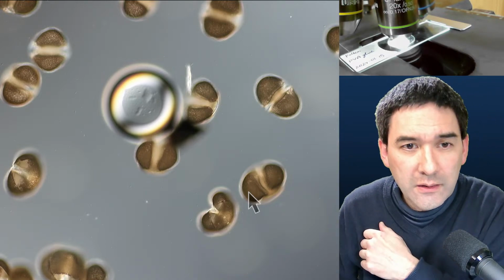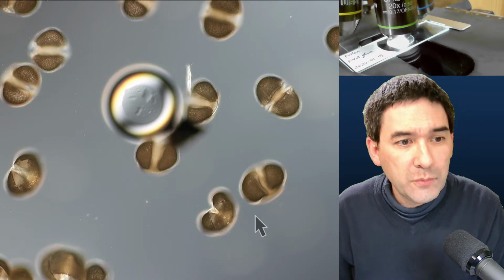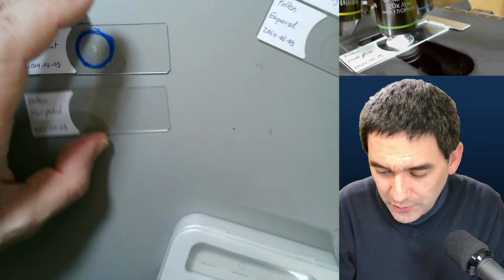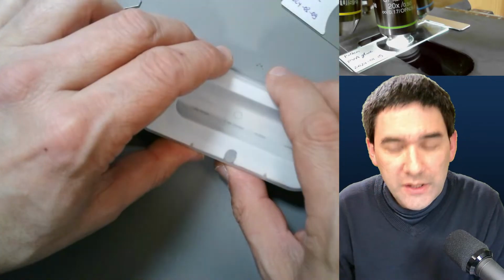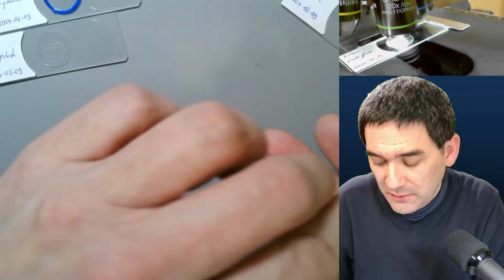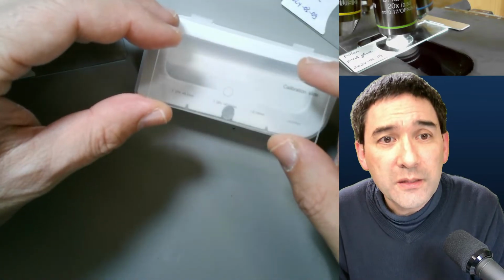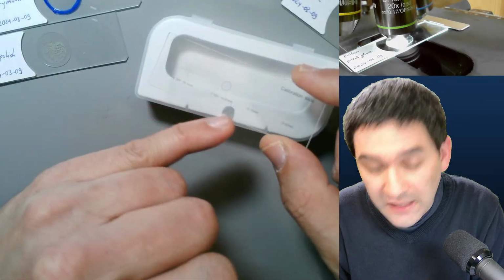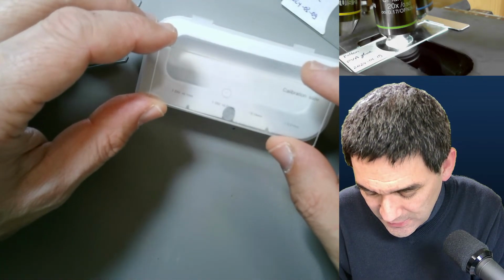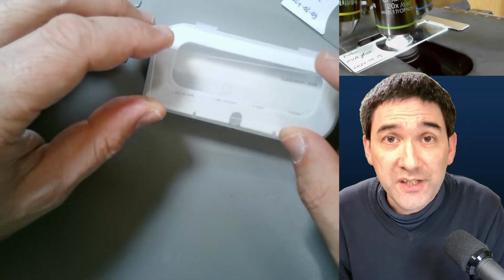Okay. And what I need to do now is I'm going to show you something that I have here. This is also something that I bought some time ago, a so-called micrometer slide, because you wanted to know the approximate size of those grains. I'm going to show you how this works. I don't know if you're able to see that, but there are some scales etched on here. And what it says here is a calibration slide. One division is 0.01 millimeter, so 10 microns. 10 microns is one division.